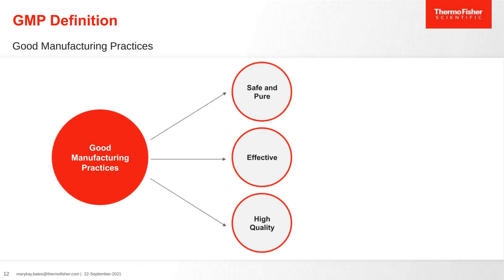And a lot of GMP is just to ensure that processes are repeatable and consistent across lots and across production lines. And I think of it as a way to remove some of the natural human variability from a system, to kind of control our natural human behavior to want to maybe skip steps.